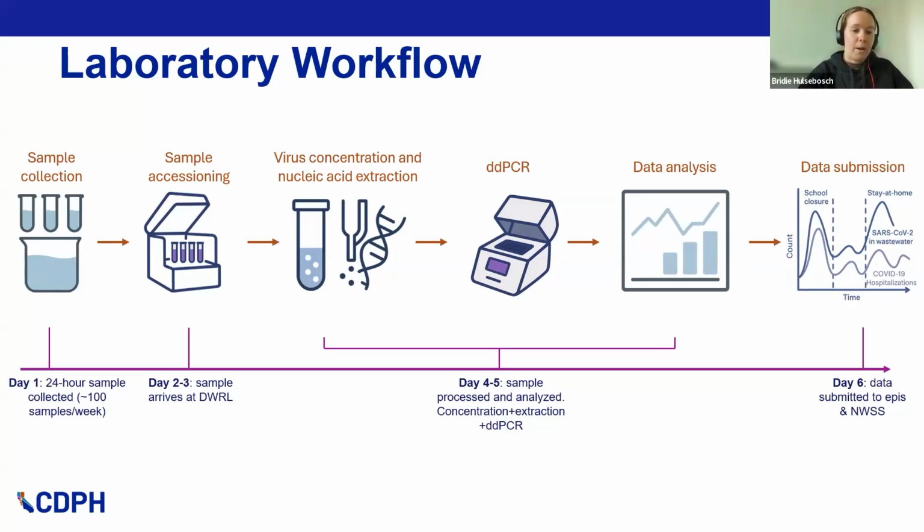And then once we have the data undergo all of its checks and it's passed all of our QC metrics, we send it off to our epidemiology team. And from there, they'll do some more analysis of the data and be able to submit it to public dashboards, to local health jurisdictions, and basically we can take public health action if needed.